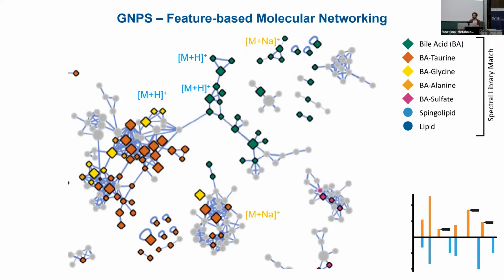And why do we have those different adducts in the first place? Because during the ionization, of course, we can protonate, but we can also add basically every cation to our molecule and ionize it this way. If we have some acid group, it's definitely going to be prone to capturing some of those cations that we have there. So those networks are going to be the basis of what we're going to work with downstream here.